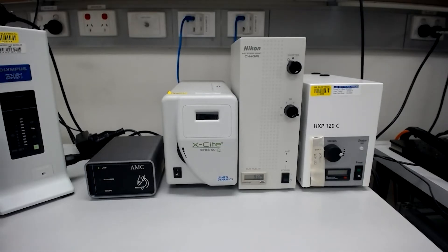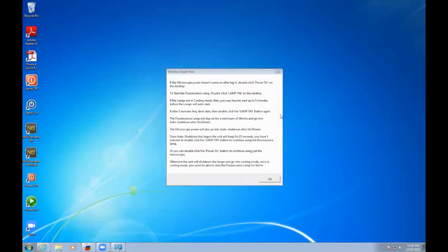The microscope, bright field lamp, and accessories turn on automatically when you log on to the computer. The fluorescence lamp can be turned on using the lamp on button on the desktop.